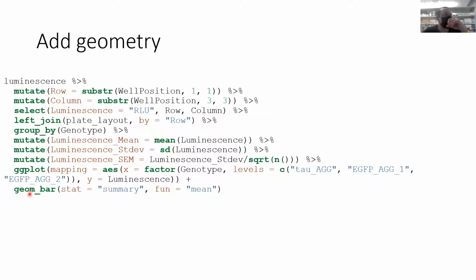Next, we add a bar graph. We could do this with a box plot, but I chose a bar graph because that's more commonly used for biology graphs like this. So if you remember from the Titanic, the bar graph wants a stat argument. You can use identity, and then it will do nothing, but that's what you would want to use if you plotted the mean. Now, because we provided the individual data points, not the mean, you have 6 data points behind the scenes for each group, right? Because we just gave it this.